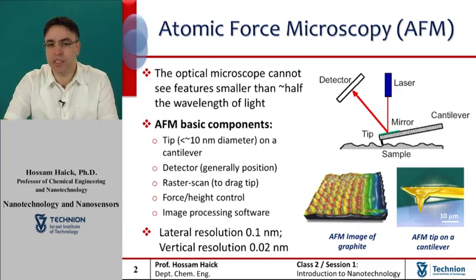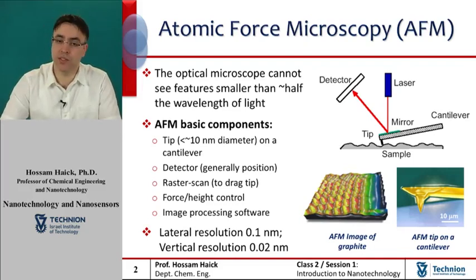Usually, the sample is mounted on a piezoelectric tube that can move the sample in the Z direction for maintaining a constant force. On the other hand, the X and Y directions are used for scanning the sample. In alternative modes, a tripod configuration of three piezoelectric crystals may be employed, with each responsible for scanning in the X, Y, and Z directions.